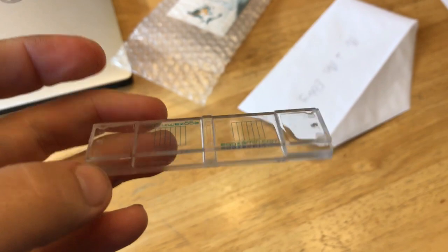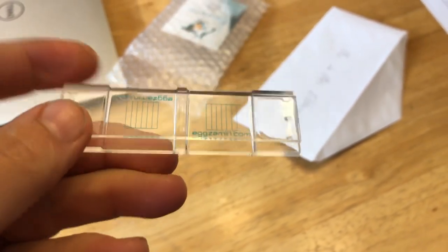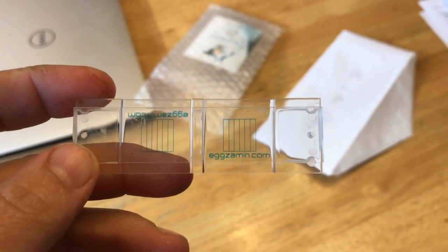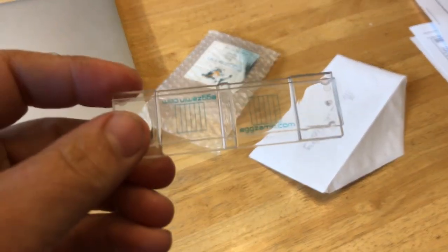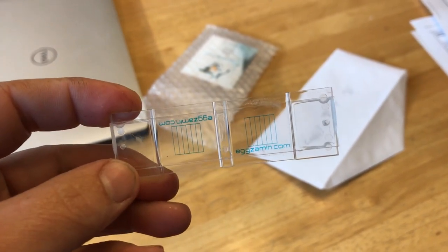My vet's recommendation is that in each field, in each column, if there's any more than three — she said around three is a moderate issue. Anything over four to five is more of a severe issue of whatever you're counting, whether it's strongyles, barber pole, coccidia, those type of things. So this is the one that I use.